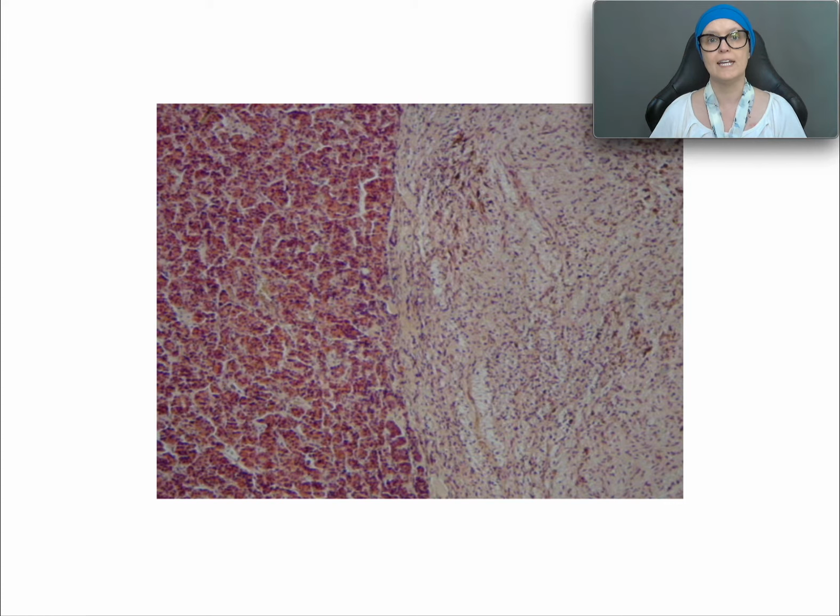First off, on each of these slides, don't forget a possible question is name the gland or name the organ. Now, if the question is name the organ, then you need to include the word gland in the answer. If the question is name the gland, then you just need the name of the gland. So, for instance, on this slide, name that gland. Okay, let's do name the organ. That way you have to put both words.